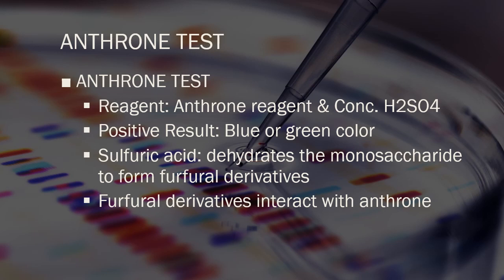With this, of course, your sulfuric acid will dehydrate the carbohydrate to form furfural derivatives. These furfural derivatives will interact with your anthrone to give you a blue or green color.